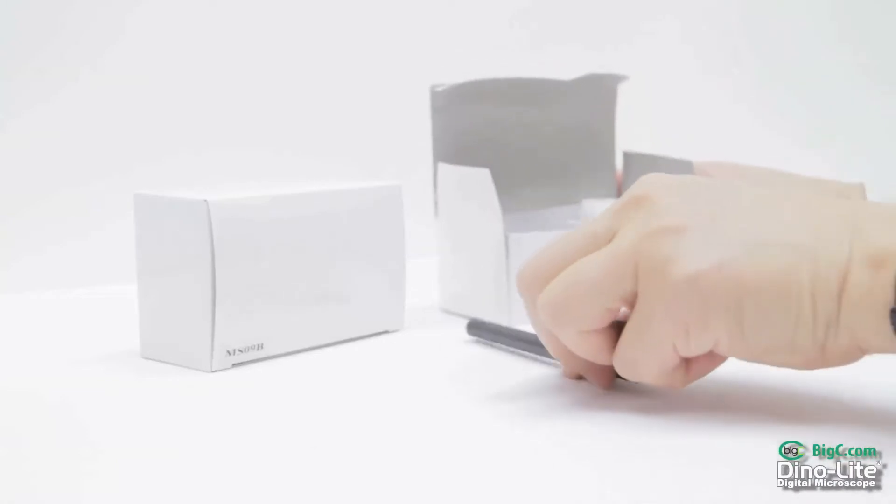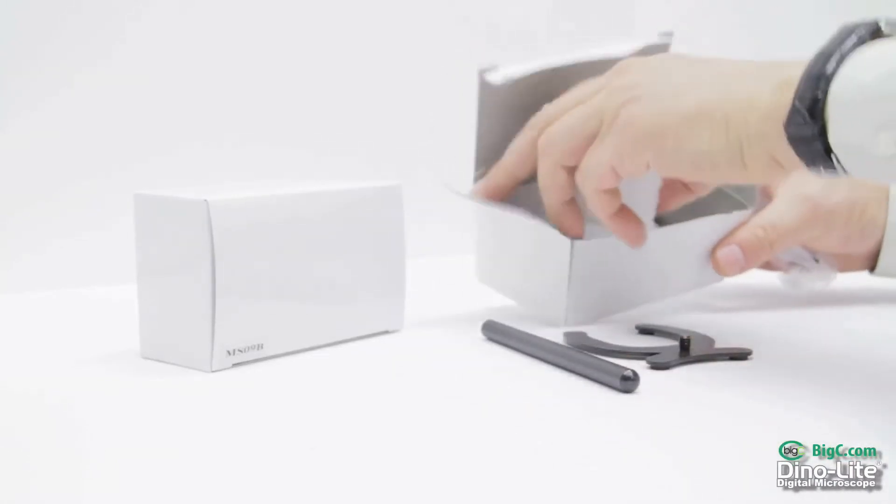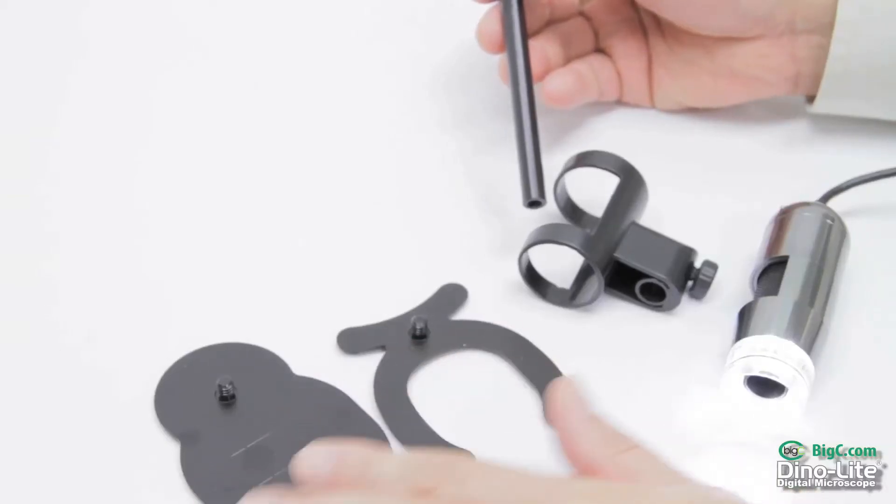The MS-09B includes a mounting pole and holster, an open horseshoe-style base, and an additional flat cross grid base. Assembly is a breeze with only three components to manage.